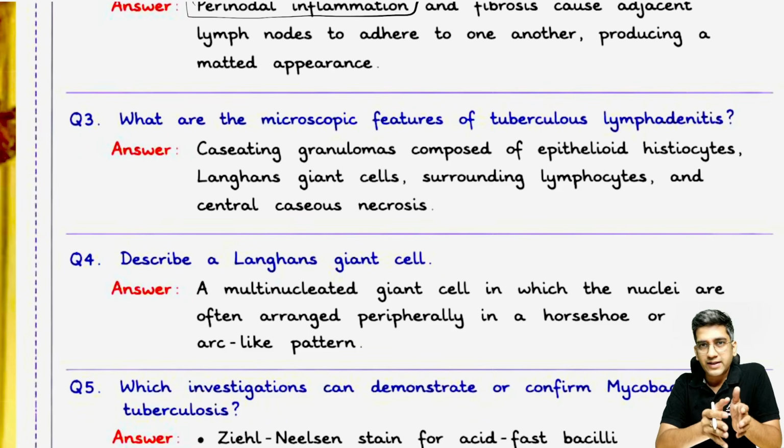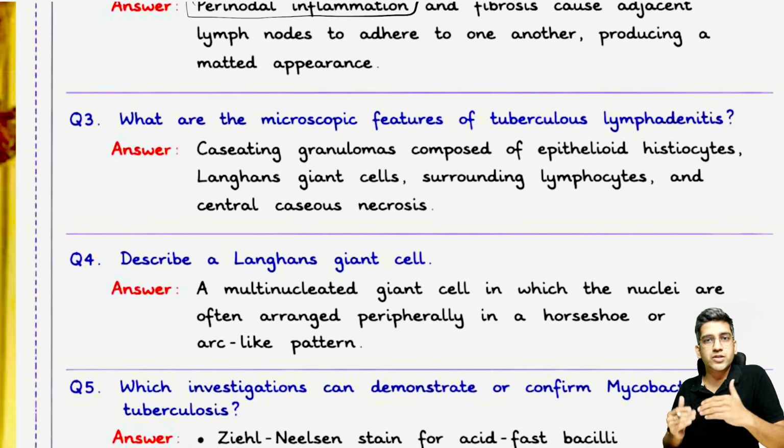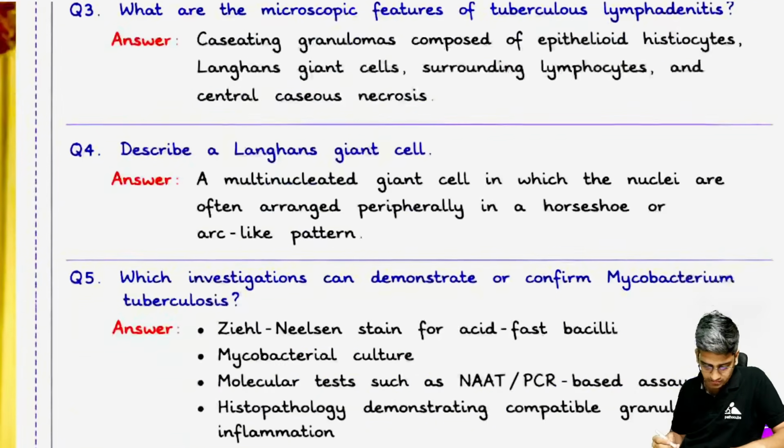Granulomas are a very important topic which might steer the discussion in any direction, right? Here I see coalescing caseous granulomas with or without giant cells. Around the granuloma, you will have lymphocytic infiltration without fail. The closest thing which comes to mind is sarcoidosis, right? Tell them that also. I will see non-caseating or non-necrotizing granuloma in sarcoid, in foreign body reaction, in Crohn's disease and many other chronic inflammatory conditions. That's more than enough, right?